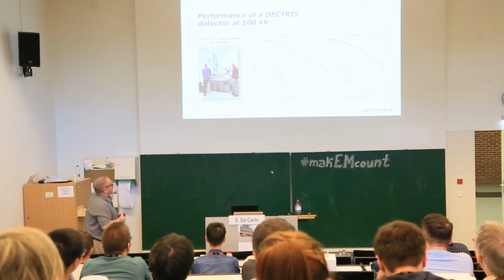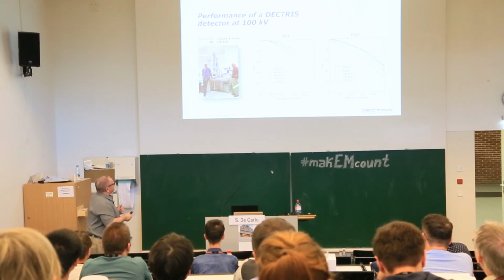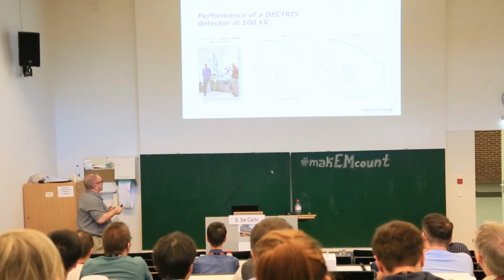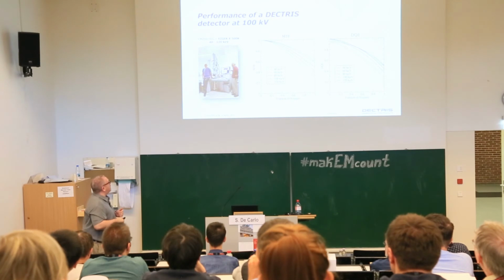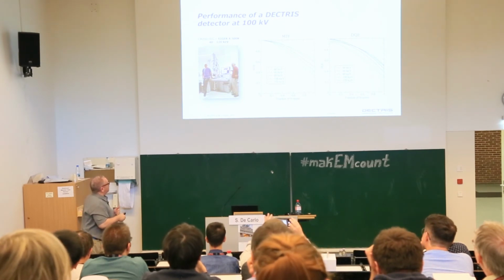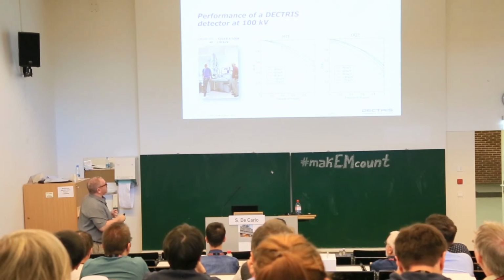But for single particle cryo-EM, for small molecules, isolated macromolecules, 100 kV is better. And they already purchased one of our detectors a few years ago. This is a picture of Greg and Richard. Here at the beginning, we had the entire detector inserted in a vacuum chamber because they are built to be vacuum compatible. In the meantime, as you saw before, we changed how they look a bit, and we provided a better vacuum interface at the front of the detector.